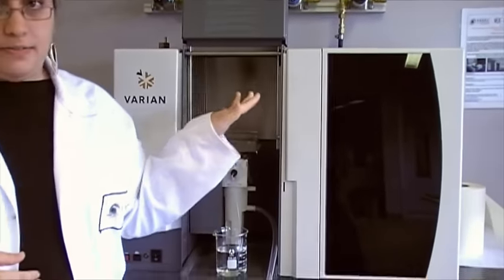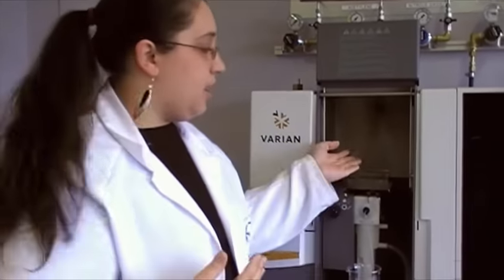Once our sample gets into our flame, three different things happen. First is desolvation, and all that means is that the solvent used to dissolve our sample is burnt off. So we're left with compounds. And then the compounds break down or decompose because of the really high temperatures. And then we have free atoms and ions which are up there in our flame.